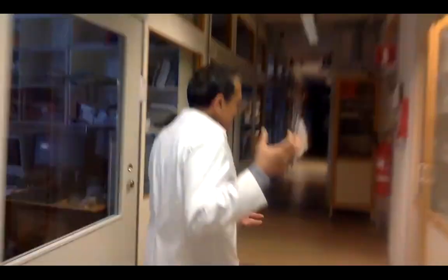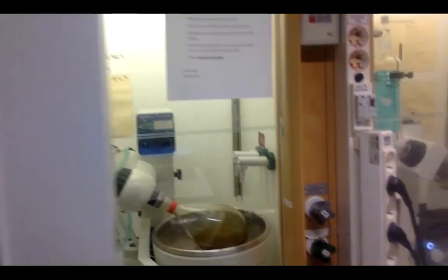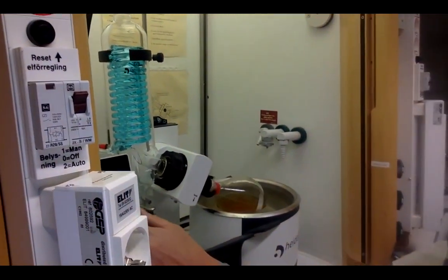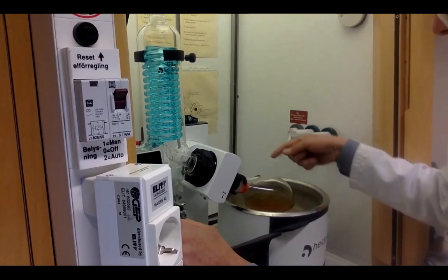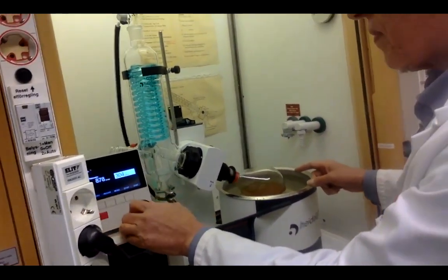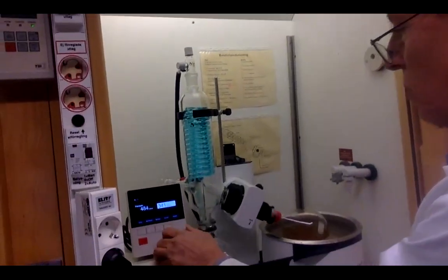After the extraction we have the filtrate. Now we go to the evaporation room. We need the extract, not the solvent — the solvent helped us extract the material. So we move to evaporation. Here you can see the rotary evaporator. Rotary means rotation, and evaporator because it evaporates the solvent. It will go quickly — we start and it takes about one minute.